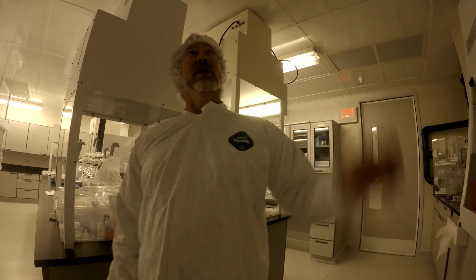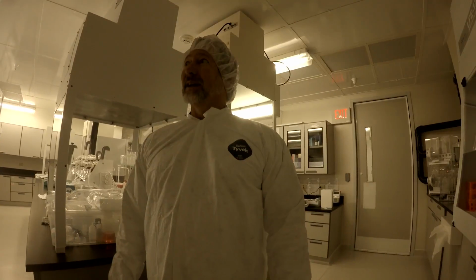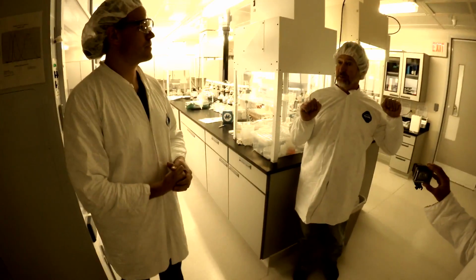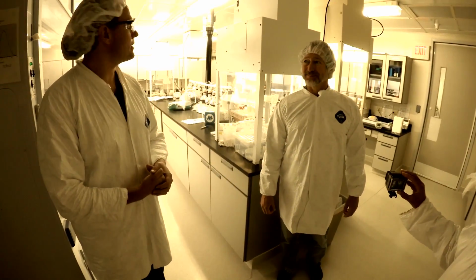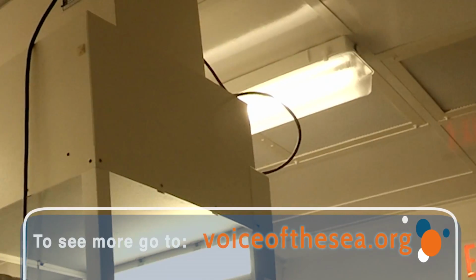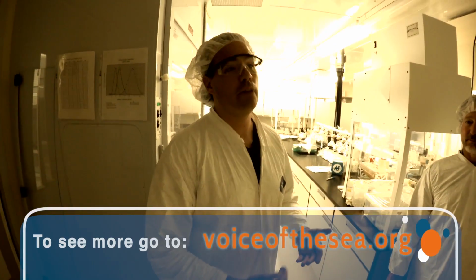With mercury, we worry about fluorescent lights because of all the mercury in fluorescent lights. They're high in mercury. So we would want to change our light bulbs ourselves. Oh, great. I hadn't thought of that. Yeah, so he worries about light bulbs. I worry about people swimming before coming into the lab. It's all what you do and what you can live with.